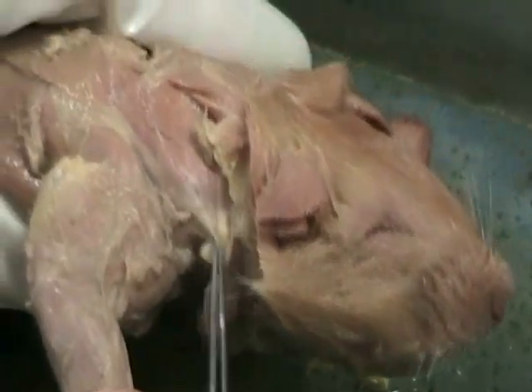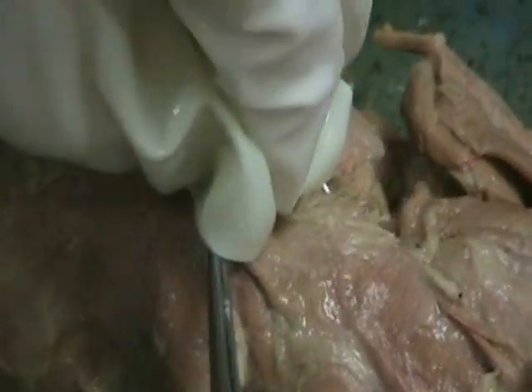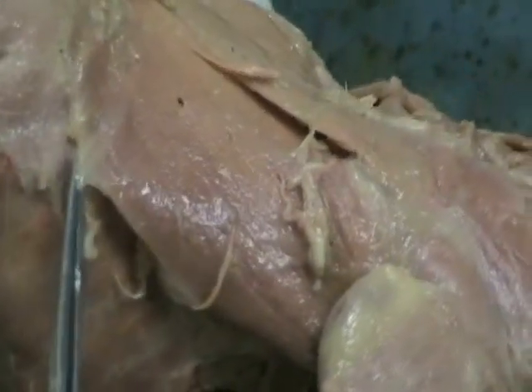This triangular one running down like this is the cervical trapezius. The one running along the top of the back here is the thoracic trapezius. Right. Okay. The one running right below it is the latissimus dorsi. Okay. And the one that we cut out of the armpit, because it attaches to the skin, this one right here is cutaneous trunci.